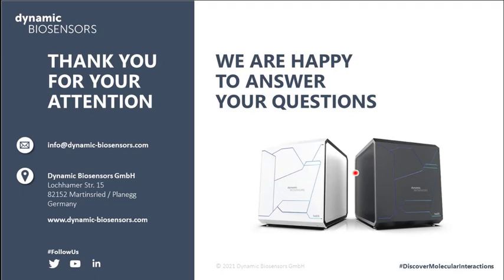And let's see, can you elaborate on antibodies binding at the same time to both targets versus antibodies that are tumbling along the targets? So by tumbling along the targets, is this a binding, dissociation, rebinding effect? The question says, of course, it's something that slows down dissociation. Perhaps the questioner can elaborate on that a little bit, and we'll get back to it.